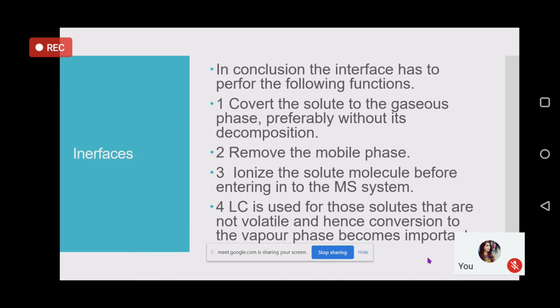So, a mass spectrometer does not separate structural isomers. Because if you take the structural isomer, that's the point. It's a good point that you raised. If you have structural isomers, like say geometric isomers or enantiomers or any other type of stereoisomers, they will not be identifiable from a mass spectrometer. Because a mass spectrometer ultimately depends on the m/z value and the fragmentation process.